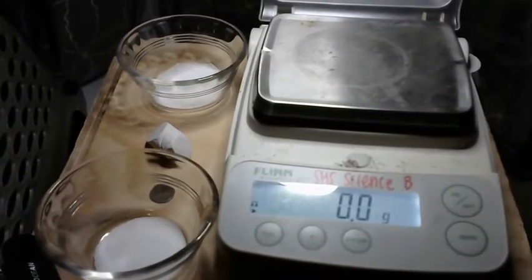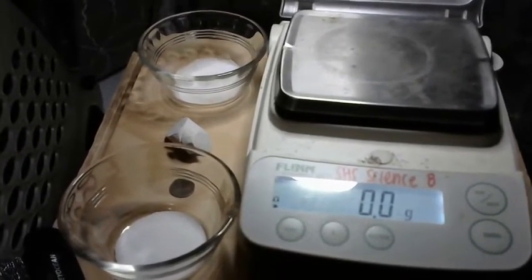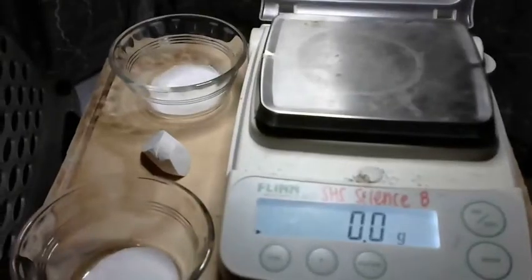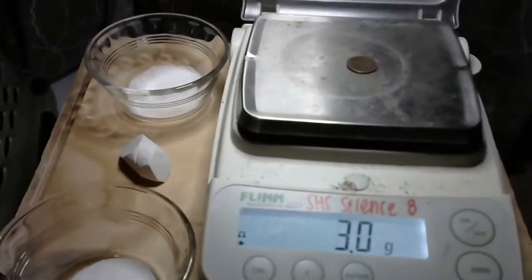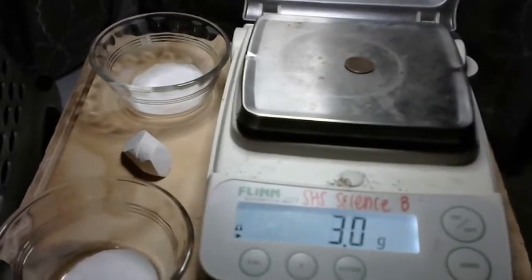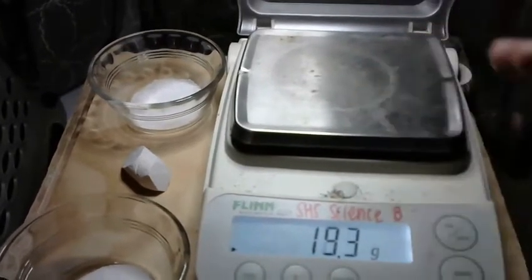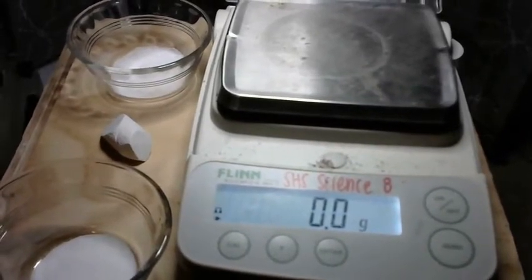So the first thing that I'm going to do is figure out how many atoms are in a copper penny. In order to find the number of atoms in a copper penny, I need to take my copper penny and find the mass of that. I'm going to put it on my scale, and my scale is reading 3.0 grams. So please, in your data, write down that the mass of copper that you have there is 3.0 grams. And this is a penny that was made in the 1950s, and so that's going to be made mostly of copper.